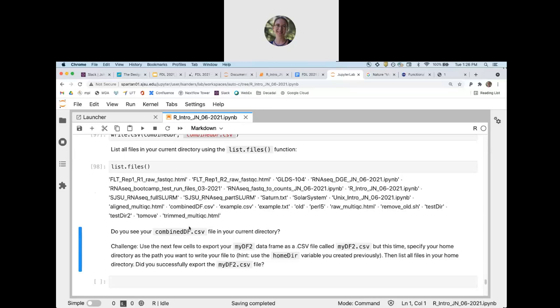All right, beautiful. Okay, so here's how I would think through this. I see some people have found the file.path function. It's important that when you run the file.path function, what you pass to it needs to be your path and the end of the path, which is the file you want to write to. So it's the whole path to the file that you're writing to.